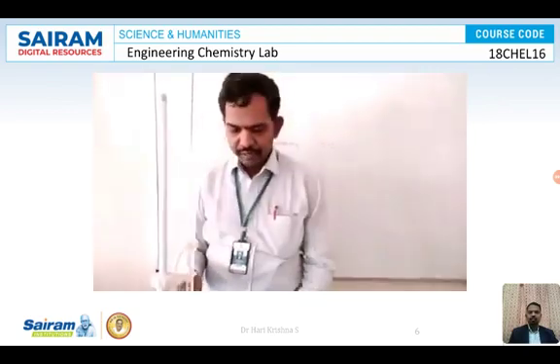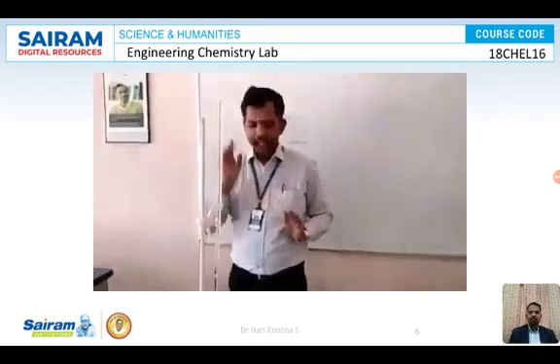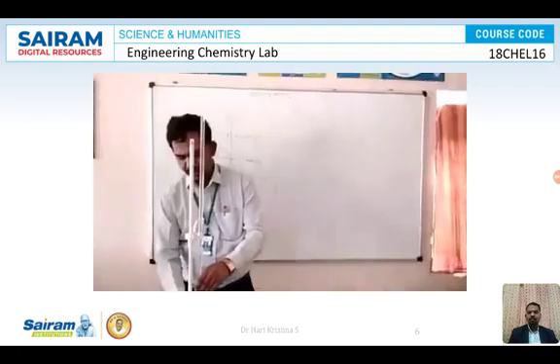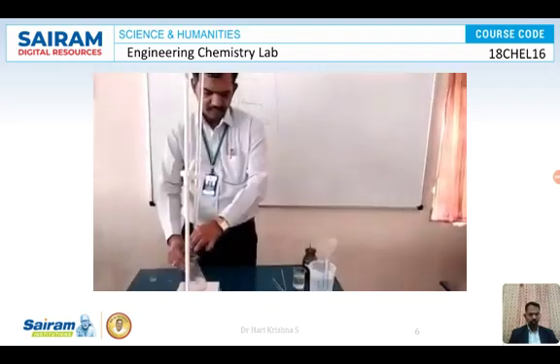Before adding, just see whether the burette reading is 0 or not. Okay, it should be 0. It's exactly 0. So I'm going to titrate it until we get light blue color.